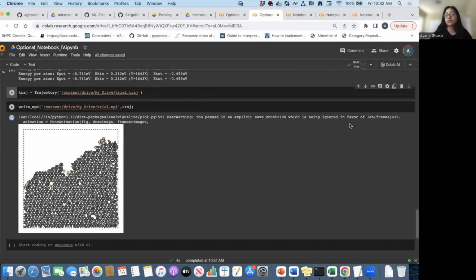Oh yeah. So, the prediction of the atomic coordinates. There are two steps. One, the prediction of the atomic coordinates utilizing AtomAI. When you're doing that, we had the simulation data as an initial training data. If you had access to some labeled data before, you could just use that to create the training data itself. So that's one part, related to the simulation.